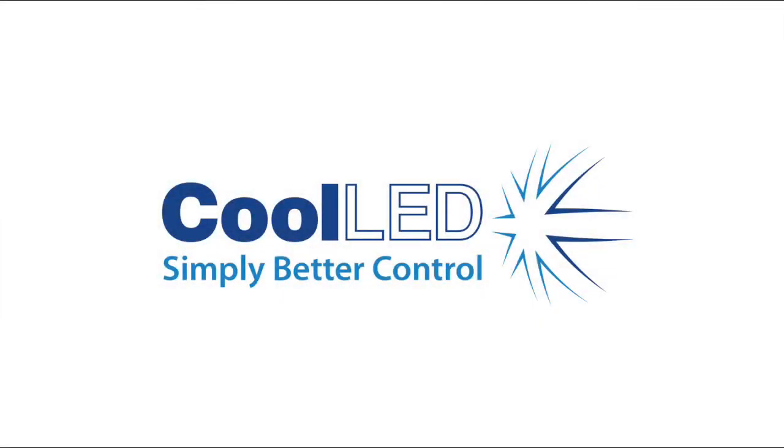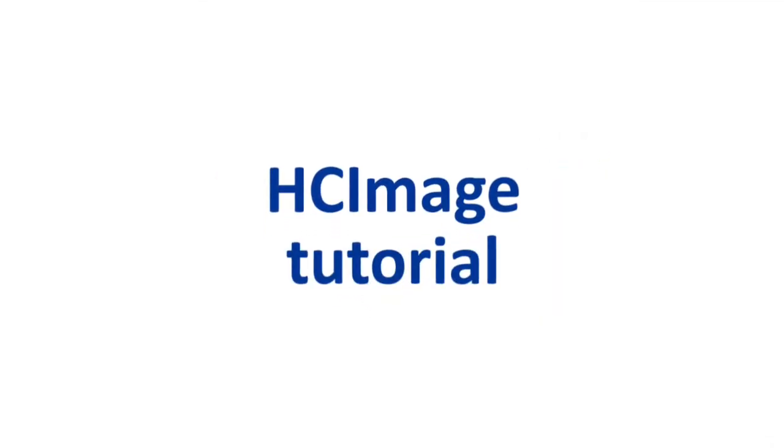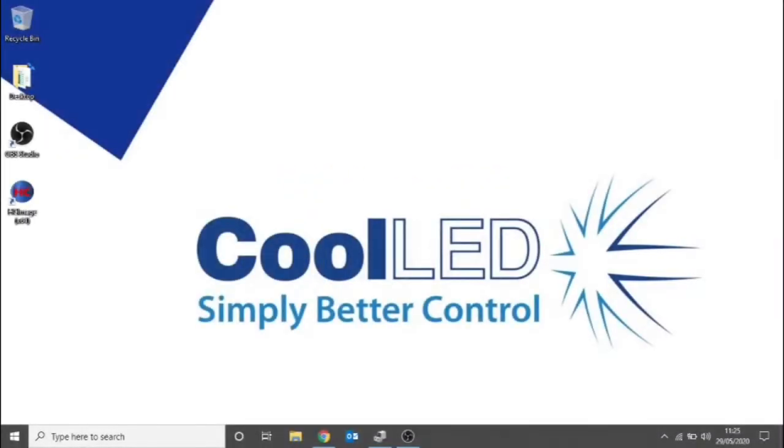Hello, and welcome to this CoolLED tutorial video for HCImage from Hamamatsu. In this video we'll show you how to set up and integrate a pE-4000 into HCImage.